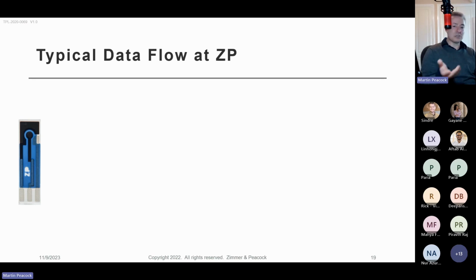I mean, the classic one is glucose. I understand that glucose is very old, so I'm not going to necessarily use glucose as an example. But somebody's come to us and said, right, first of all, I want to make an in vitro diagnostic sensor. So they've commissioned us, so we go into the lab and we take our screen printed electrodes with us, and we will functionalize it.